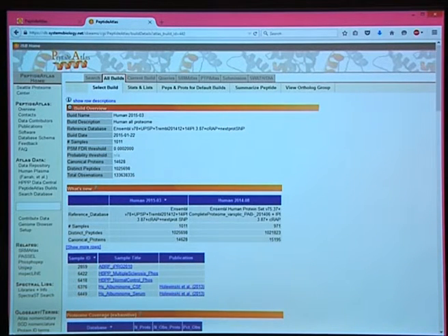In the UniProt file, they're called variants. Some of them are from dbSNP, some are from other places, primarily from cancers and other things. But by including that in our search database, and then again in our mapping database, we are able to detect these, and we're able to display them in our user interface. So if you're interested in variants, in SNPs, especially for the organisms supported by UniProt, we can show them. This is now done for the human and the mouse, and it's becoming the norm for other builds as well.